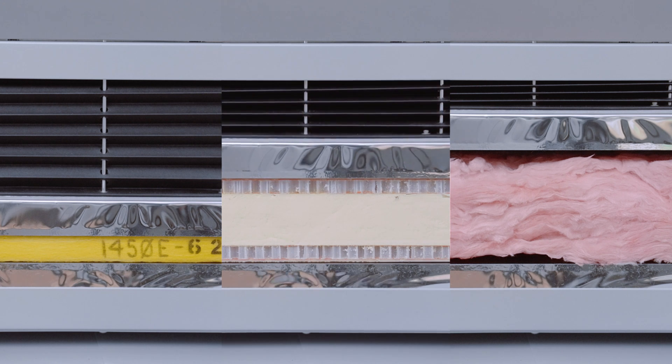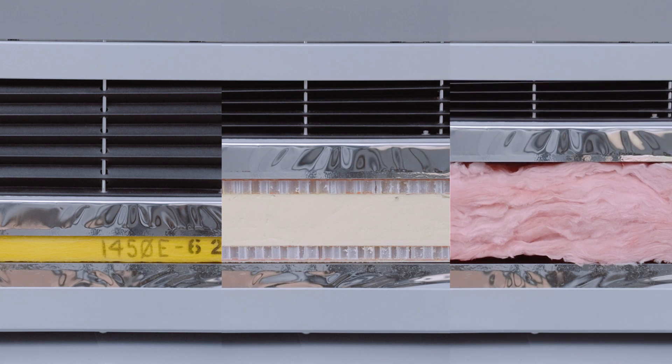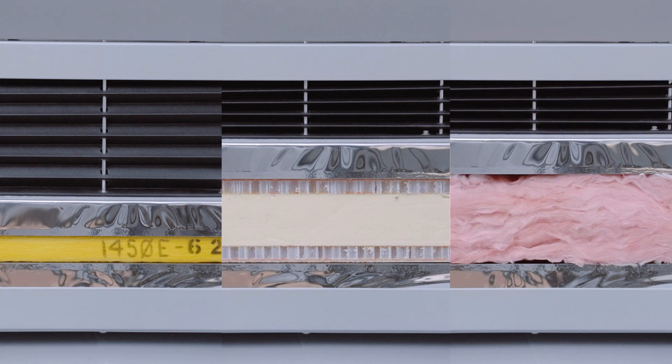For maximum sample type flexibility, rigid materials can be auto clamped at a standard force while compressible materials can be set to a specific thickness.